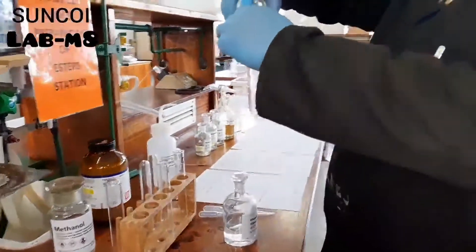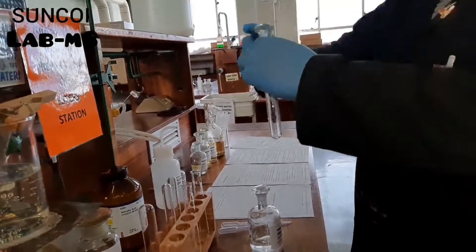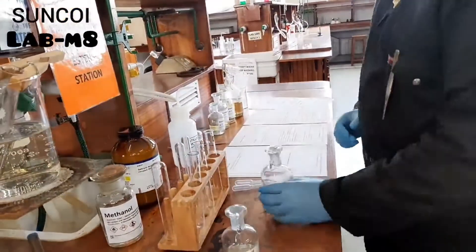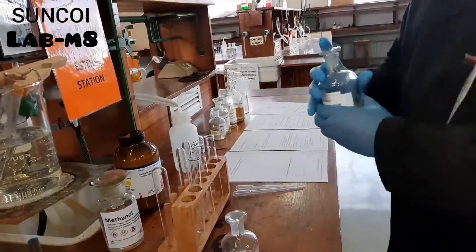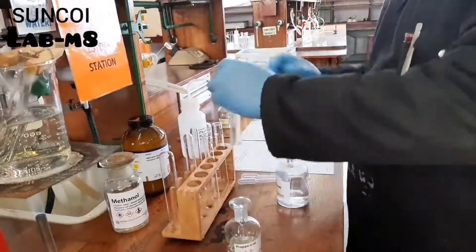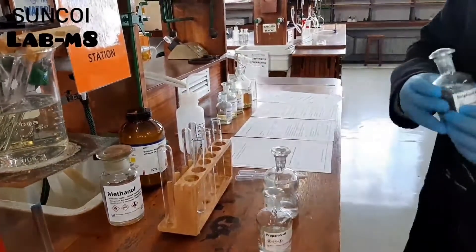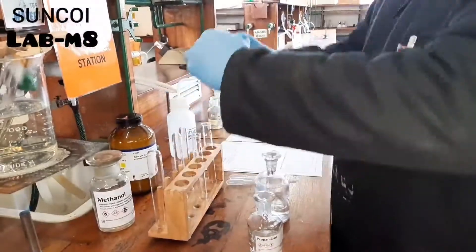For experiment B, he's adding propanol to the test tube, then a few drops of ethanoic acid, and of course again a few drops of sulfuric acid.